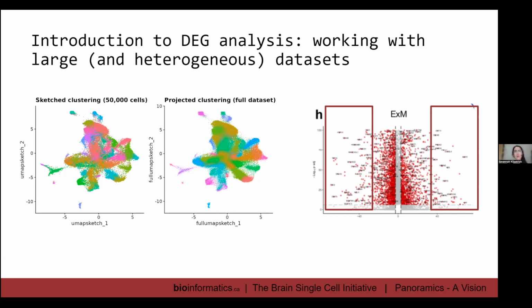Lastly, what you can do is also filter your DG list by some of the genes that contribute towards the natural variability in your data set. So these would be looking at the genes within your principal components, PCA 1, 2, 3, or 4, and you can exclude them from your DG list. Just know that that might be excluding some genes that are truly differentially expressed, but it could kind of hone in on the biological heterogeneity as well.